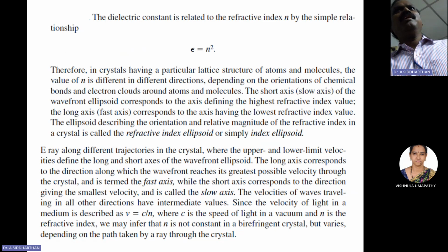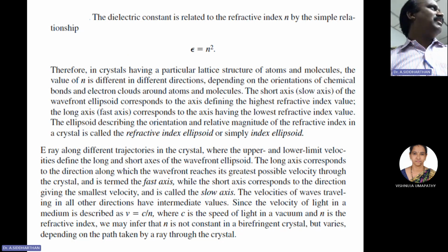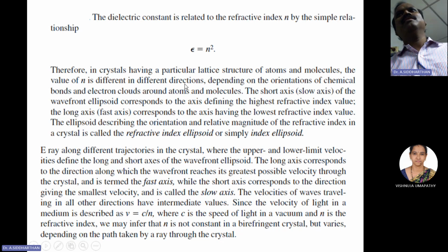By incorporating the polarizer and analyzer in the microscope, if the material responds to polarized light, it can reveal features which are not seen in bright field, dark field, or phase contrast. Additionally, you can see some features. So that is the idea for going for the polarization microscope.